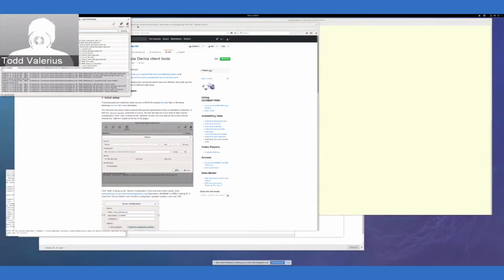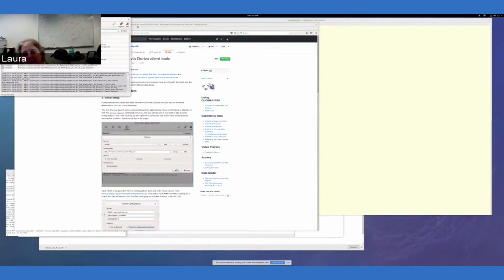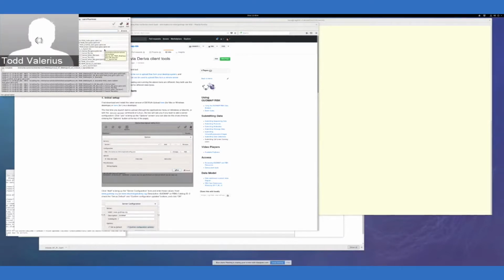Laura, just so I get this point across from my own understanding, this is best for really large files. It is, and I should have said this went through blindingly fast because these are tiny files that I have created just for demonstration purposes. But yeah, these are for big sequencing files. Okay. But it's a matter of preference.